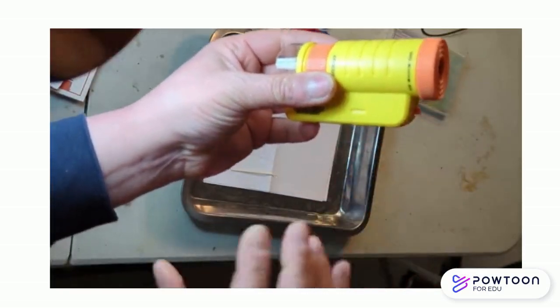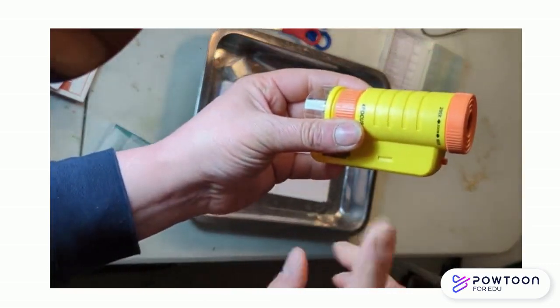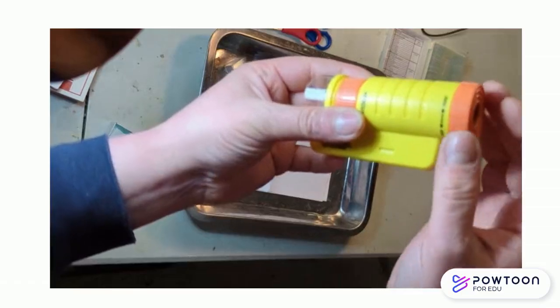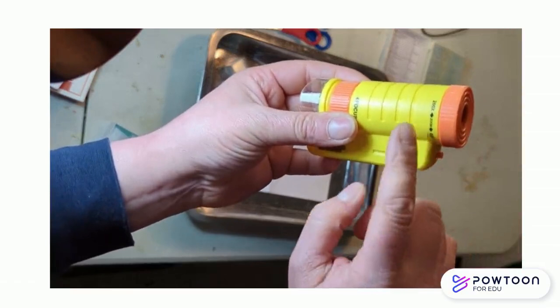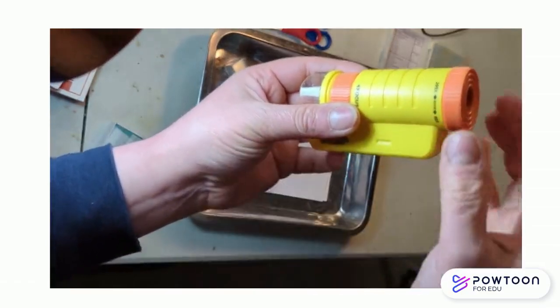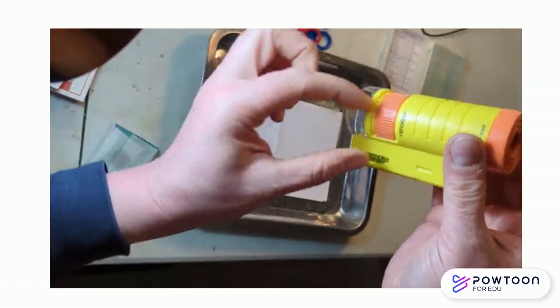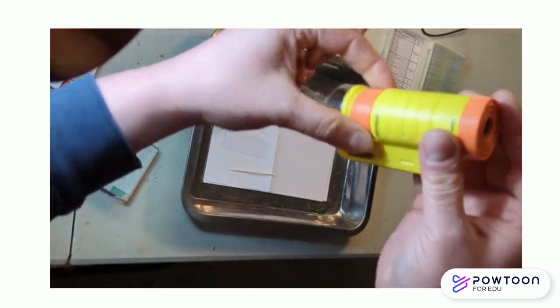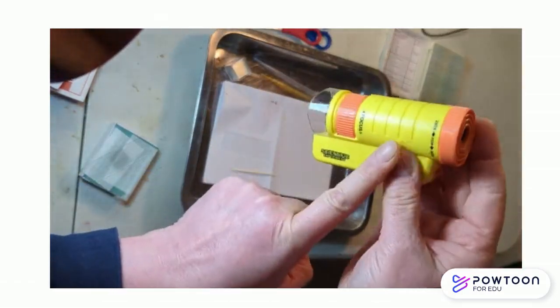This is something for both juniors and seniors, although seniors will use it much more. So they both have to understand there are two things that you have to worry about when you work with your microscope. It's magnification, so how big do you want your vision to be, and focus. And if they've got cameras, they understand what focus is. So there's no hard and fast rule.